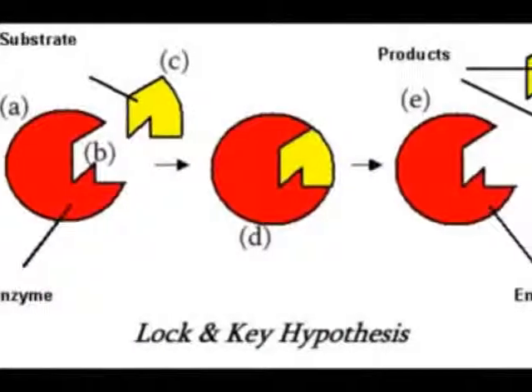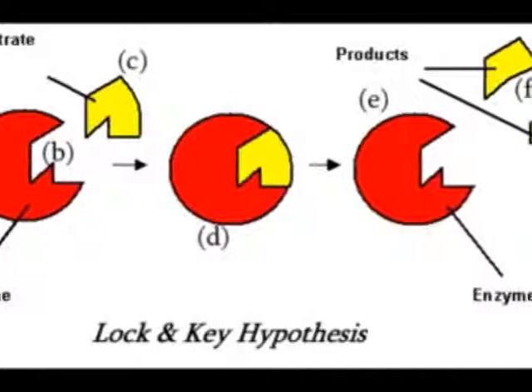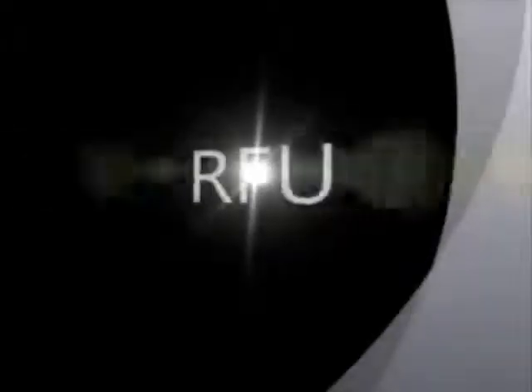Wait 30 minutes. During this time, reagent A will be reacting with the bacterial enzyme if present in the sample. If the bacteria and its enzyme are present in the sample, then the substrate contained in reagent A solution will couple with the enzyme and a fluorescent tag is broken off from the substrate molecule. This fluorescent tag will be detected by the fluorometer and measured in RFU or relative fluorescent units.